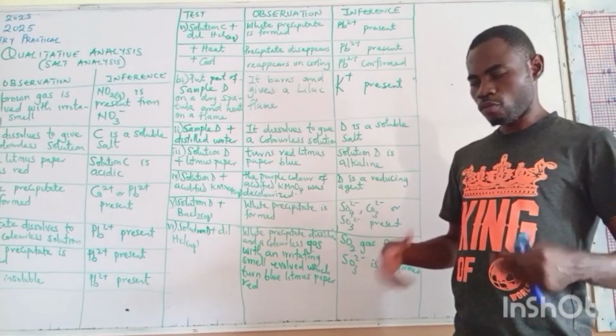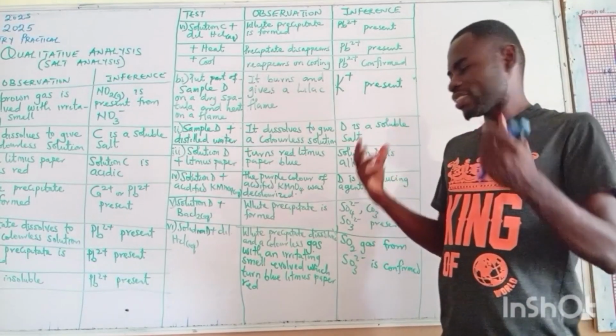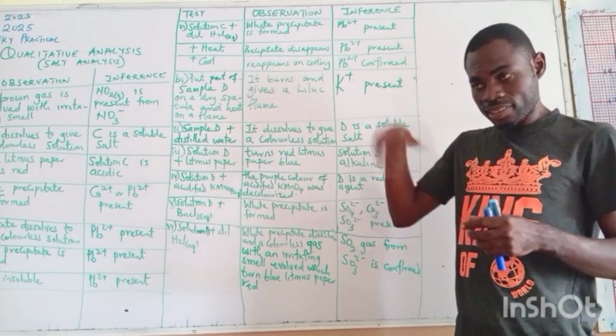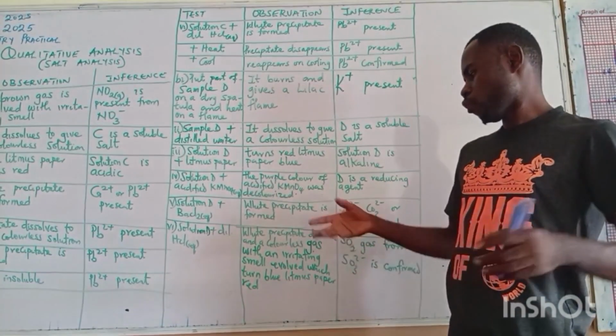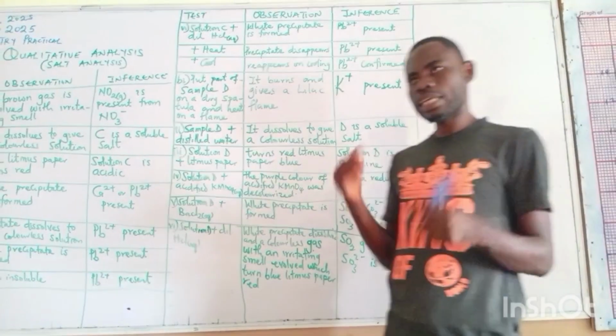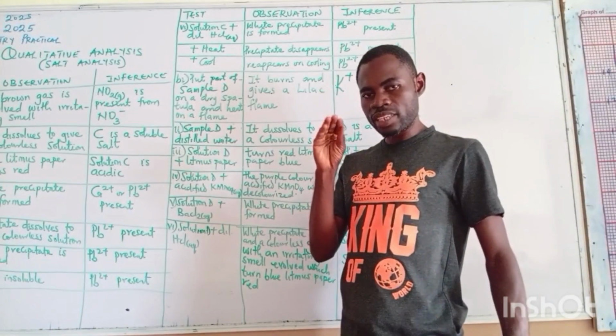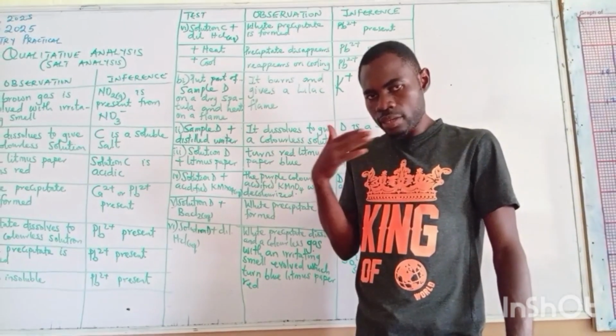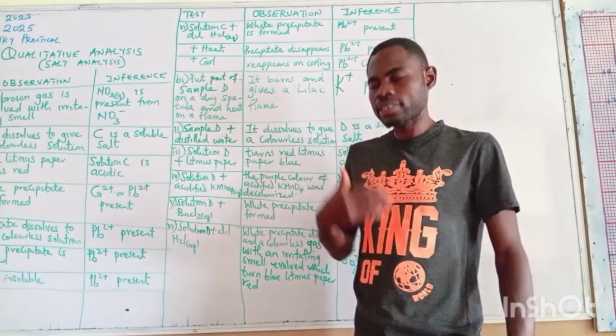After dissolving, what happened? A colorless gas with an irritating smell evolved. We could perceive the colorless gas, the irritating smell, something is smelling here, but we could not see the gas, because it is colorless.